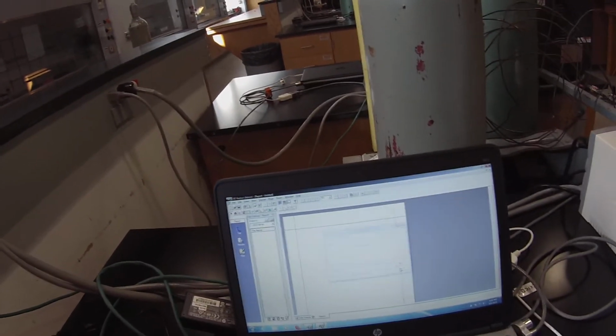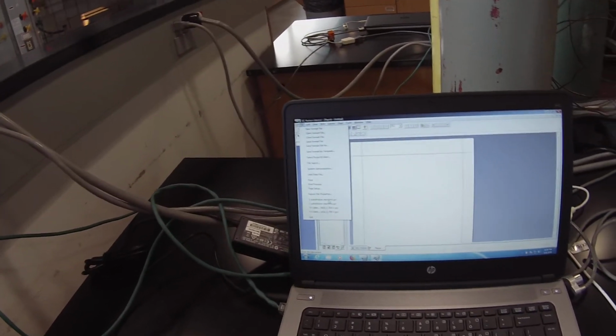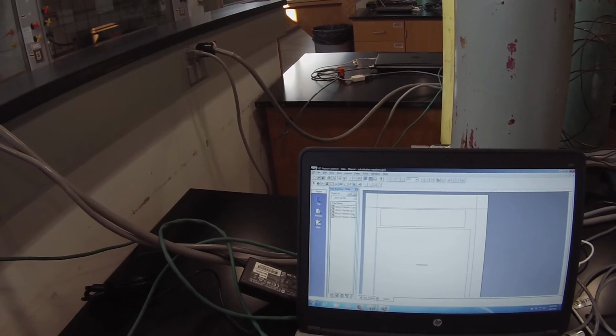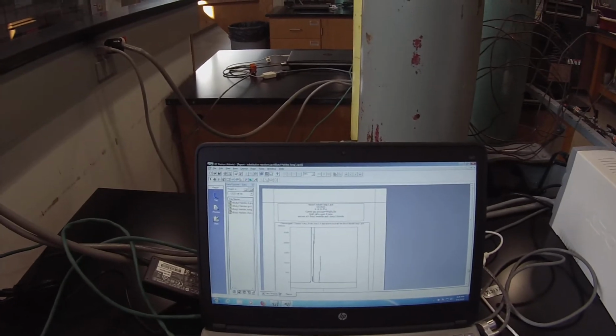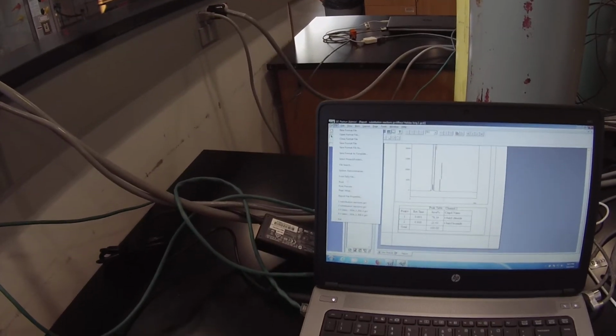Actually, I don't actually have to go there because the substitution reactions is there, since it was the last thing I used. Here's my t-butyl halides long, and print that guy.